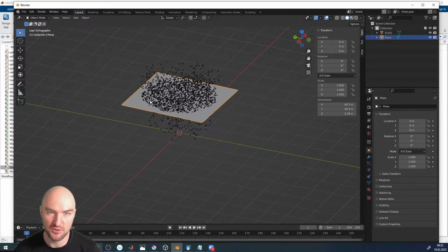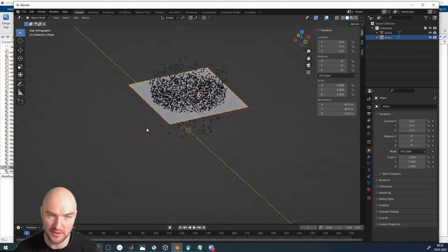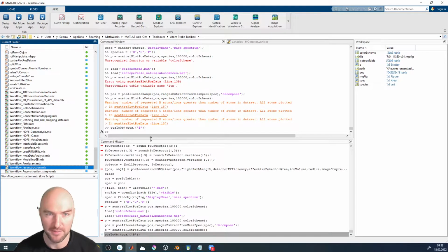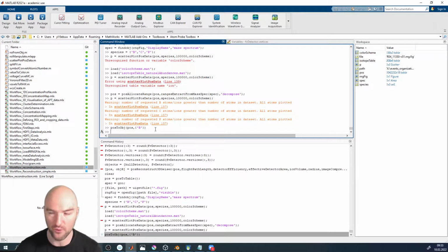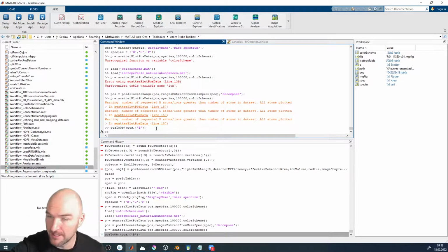And the first thing is we need to know where the boundary of our object is. So we need to know what the boundary of our data set is, and we've already talked about that yesterday. The best way to do that is if you already have a reconstructed model with nice mesh topology and everything. But maybe you have a POS file, maybe you don't want to do your own reconstruction. In this case, we'll just create it off of our data here. And this is what we did yesterday already with the sampled alpha hull command.